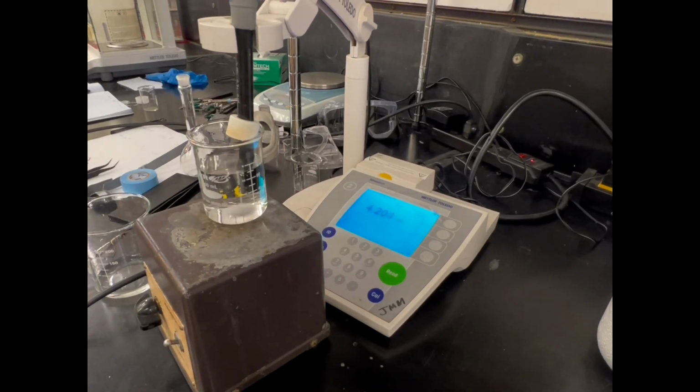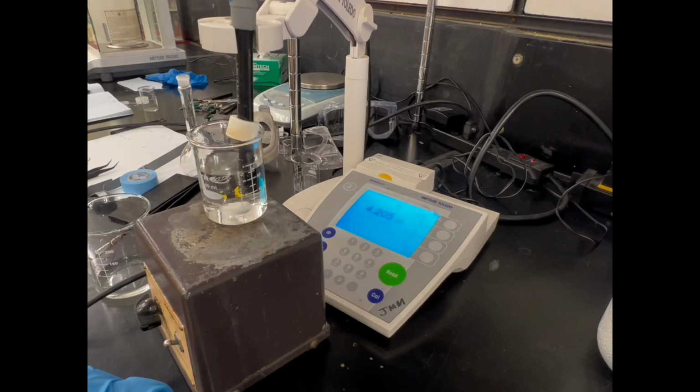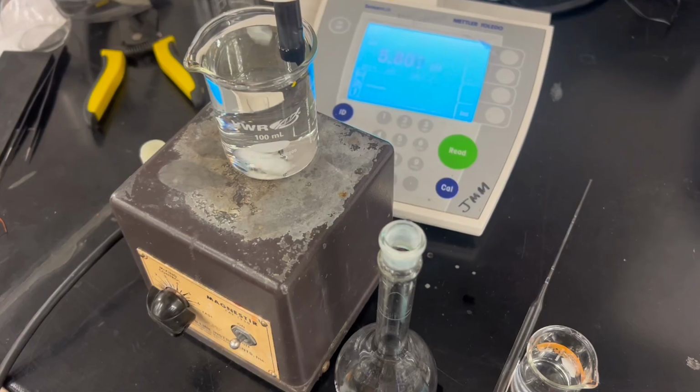Now I'll walk you through the whole protocol. For the solution preparation part, I think it's already very straightforward on the written SOP. But there are still 2 points that I want to remind you guys, so it is easier and faster for you guys to make the solutions.